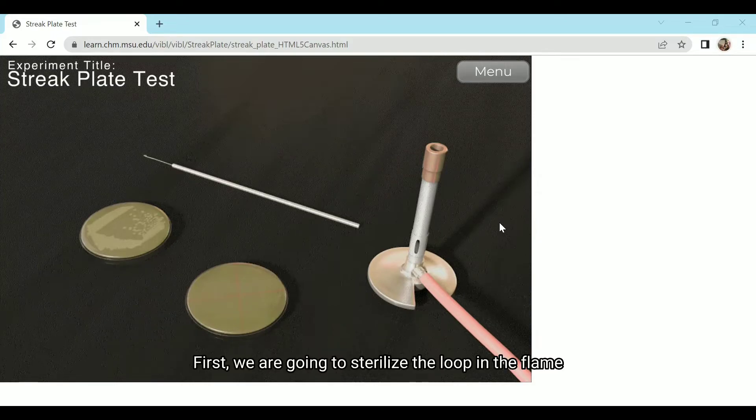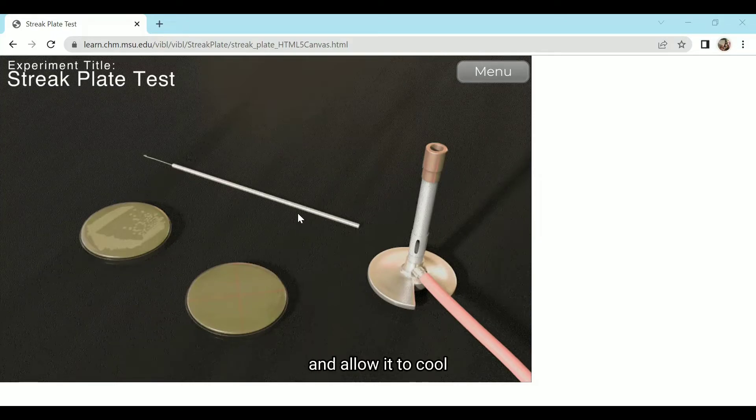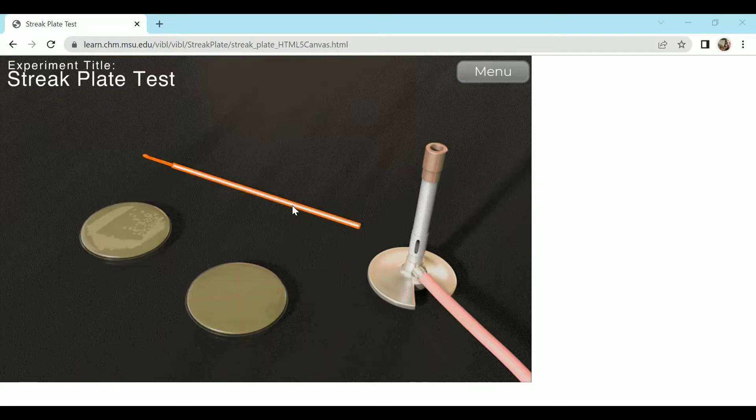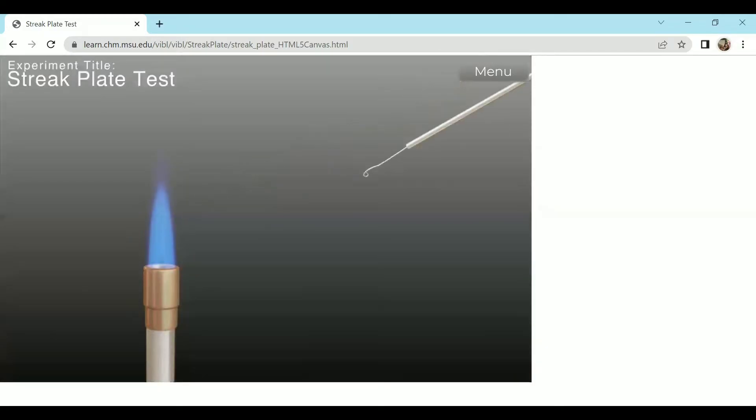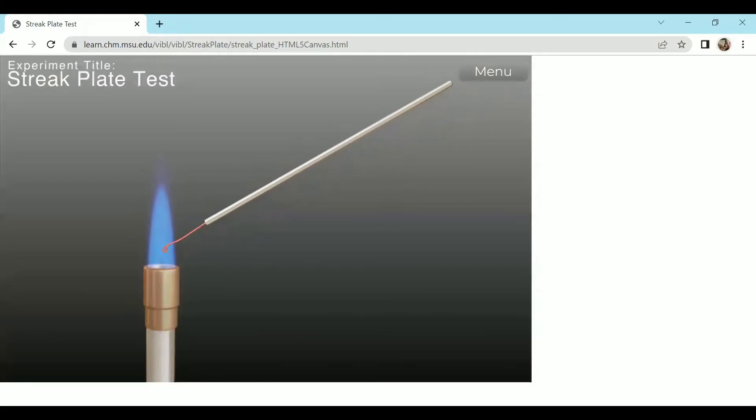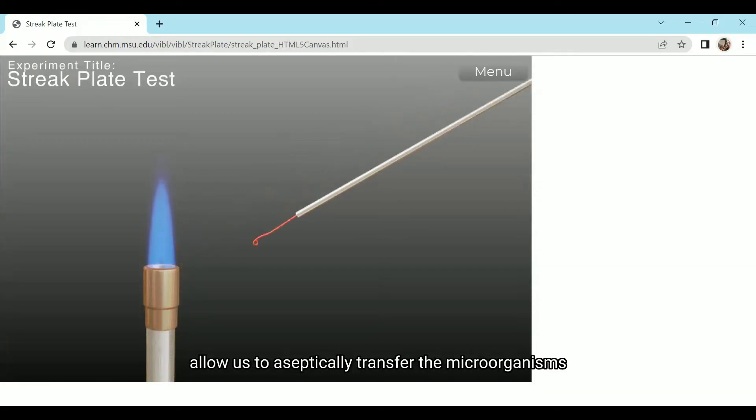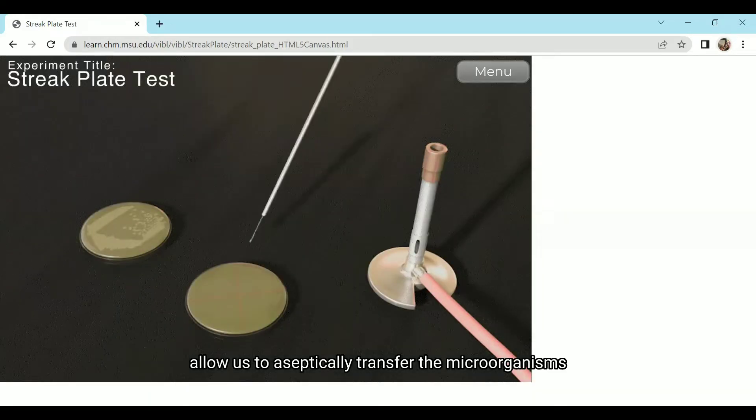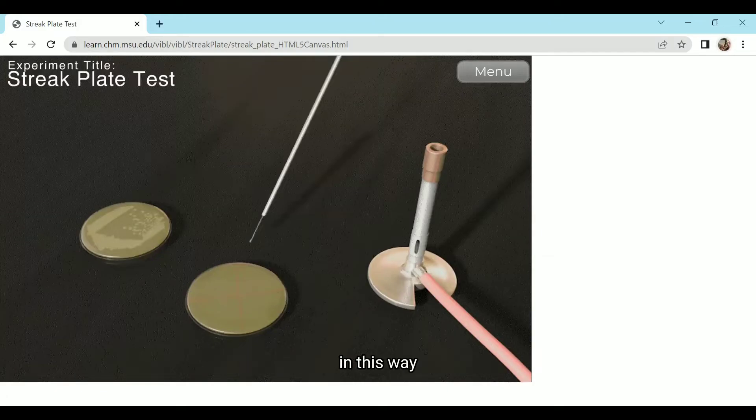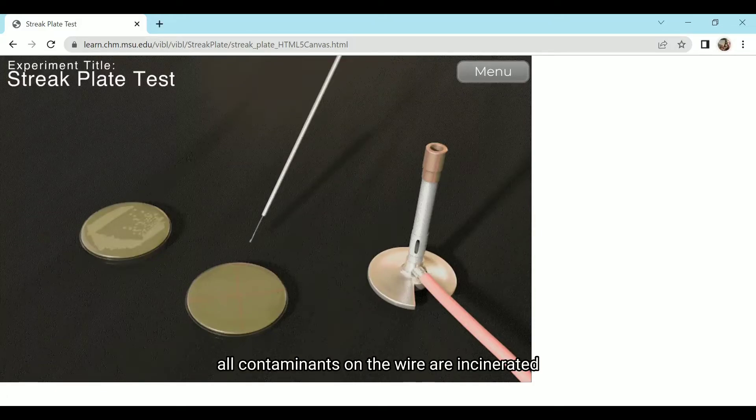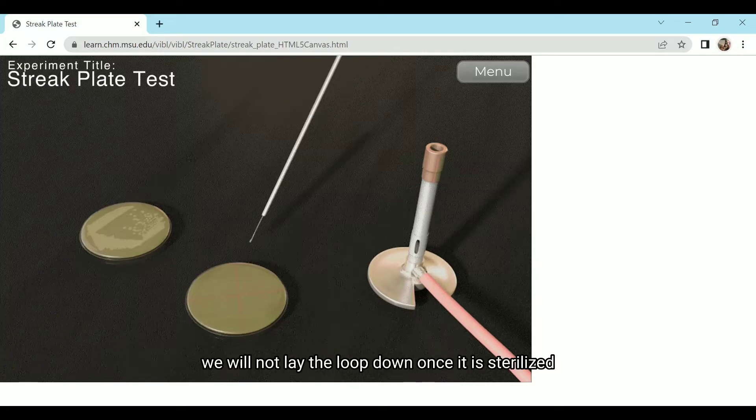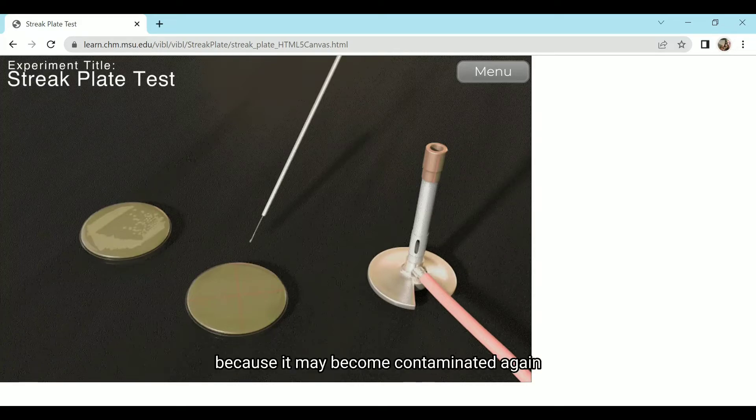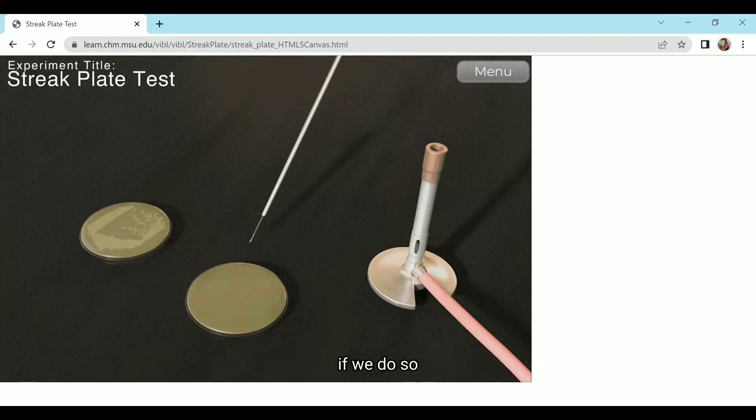First, we are going to sterilize the loop in the flame and allow it to cool. Sterilizing the inoculating loop will allow us to aseptically transfer the microorganisms. In this way, all contaminants on the wire are incinerated. Aside from that, we will not lay the loop down once it is sterilized because it may become contaminated again if we do so.